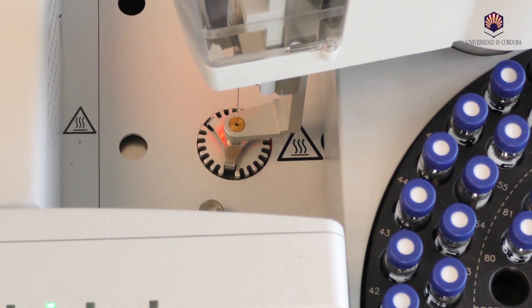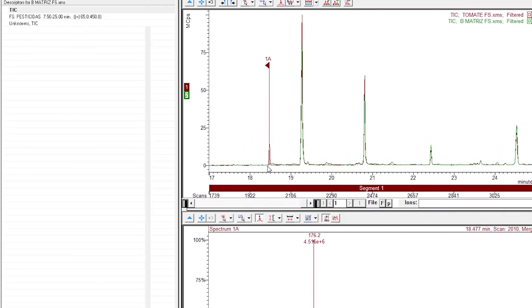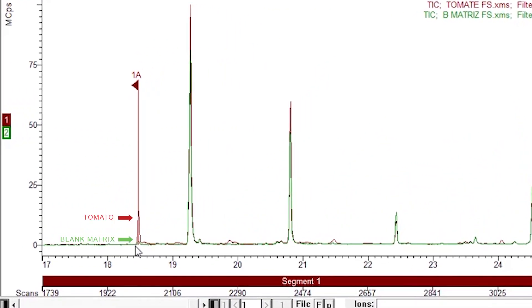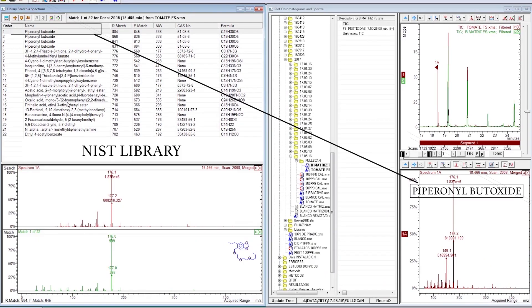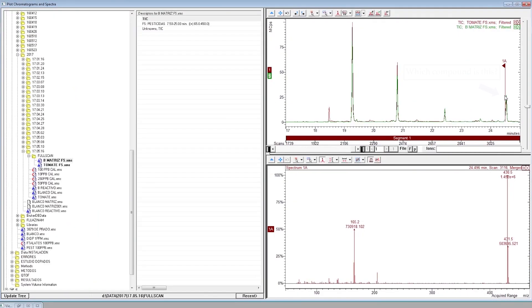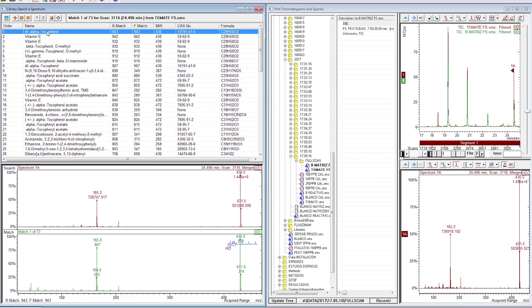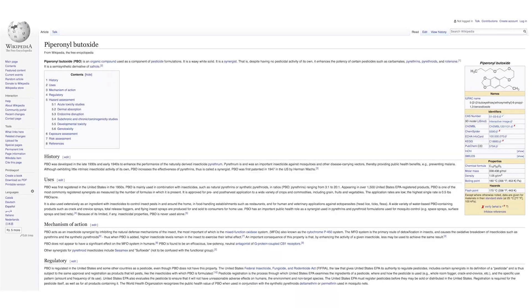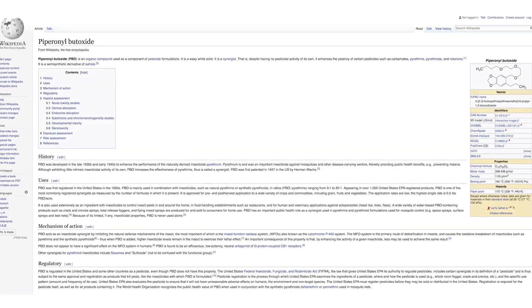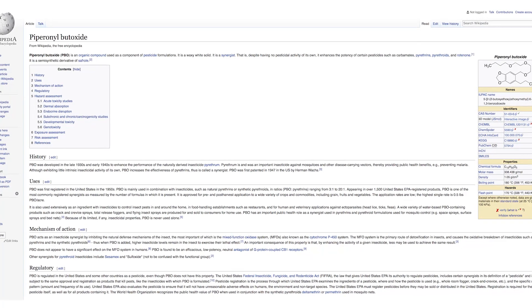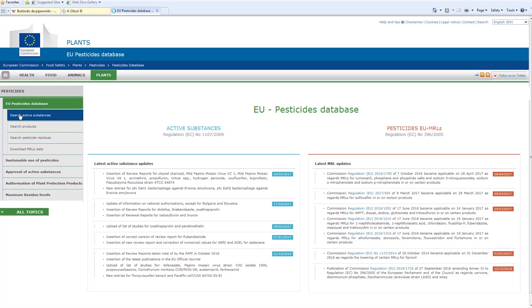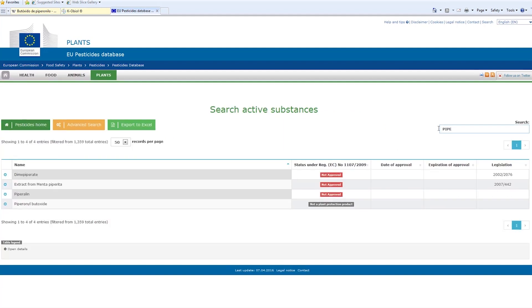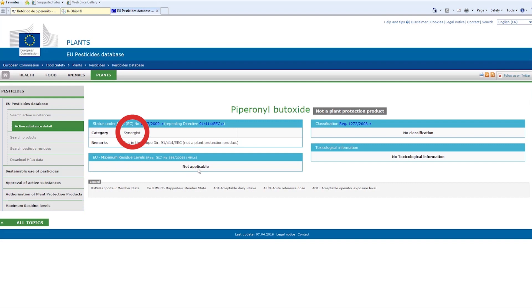Once GC-MS is ready, the analysis of the samples will begin. When processing the data, we can observe a chromatographic peak in the sample that is not in the matrix blank, which is identified as piperonyl butoxide. Another type of data can also be extracted from the chromatogram of the tomato sample, such as alpha-tocopherol, with a reverse match of 943, which is the main component of vitamin E. Piperonyl butoxide is a synergist of pesticides — that is, it does not have pesticide properties, but it considerably increases their effectiveness. We look for this active substance in the European Commission's pesticides database, where we can verify that it is classified as a synergist.